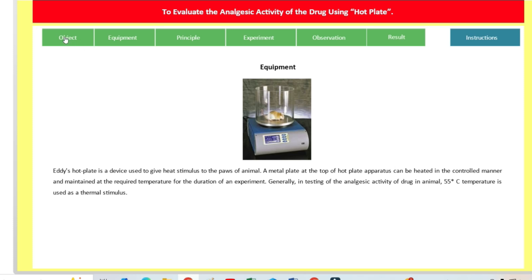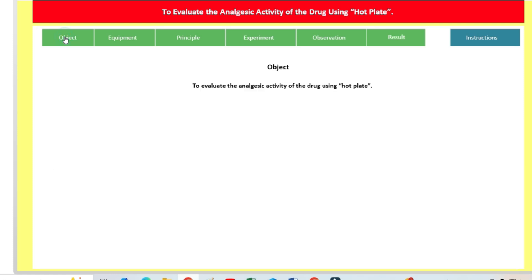The objective of the experiment is to evaluate the analgesic activity of the drug using the hot plate.